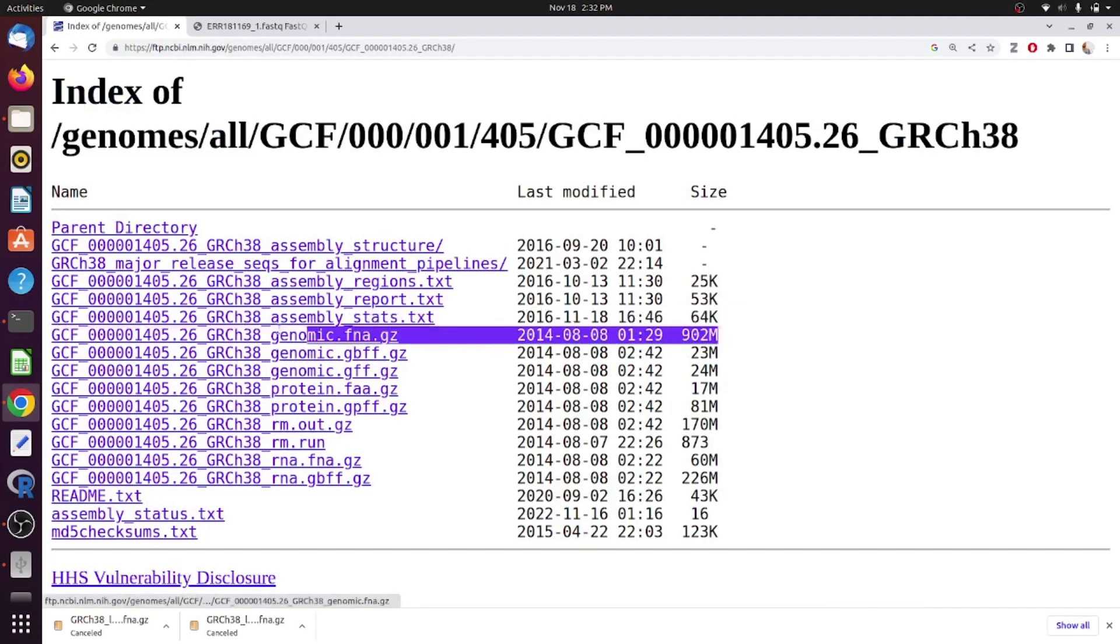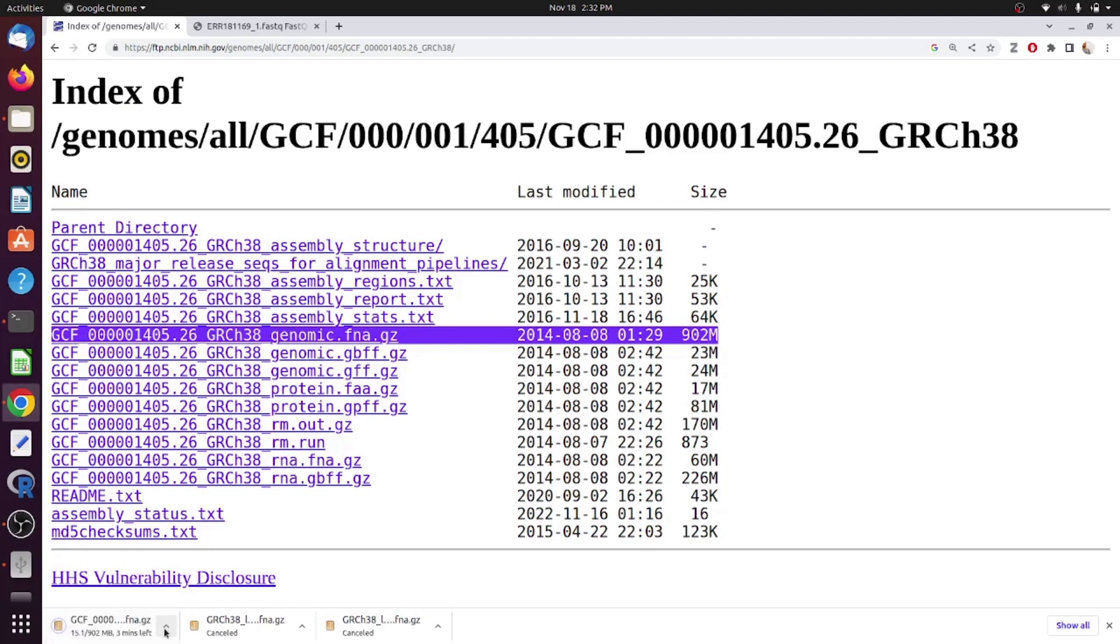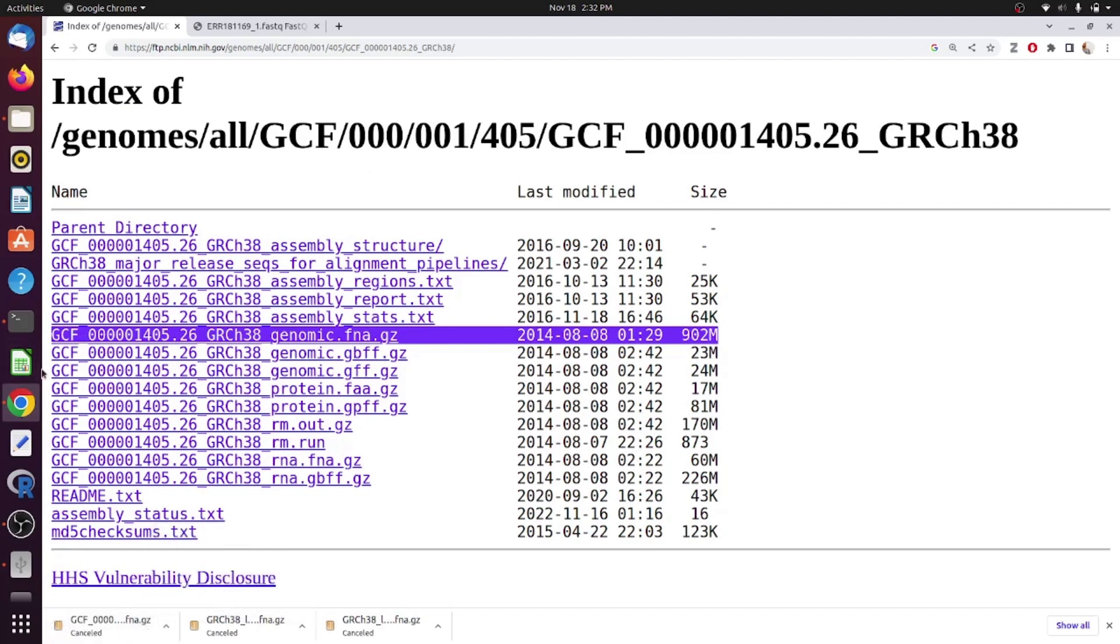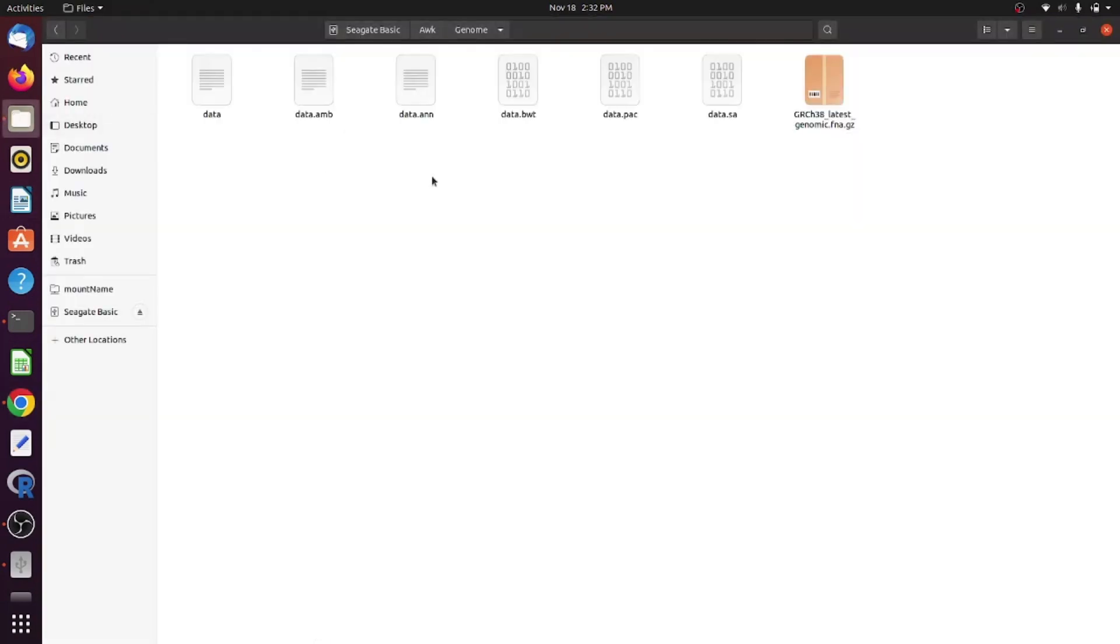I will download GRCH38 genomic sequences which is of 902MB size. You just have to click the link and it will be downloaded. It will take a bit of time and the genome will be downloaded.